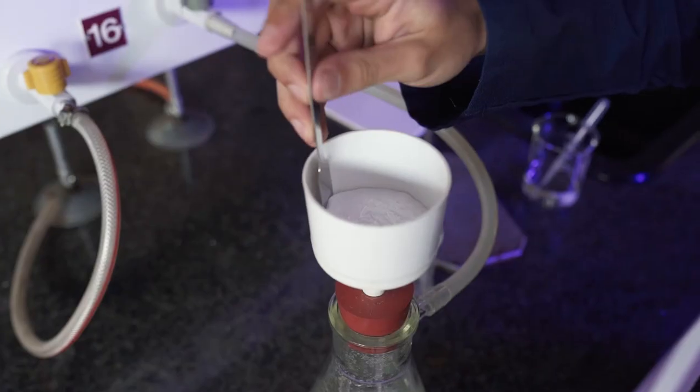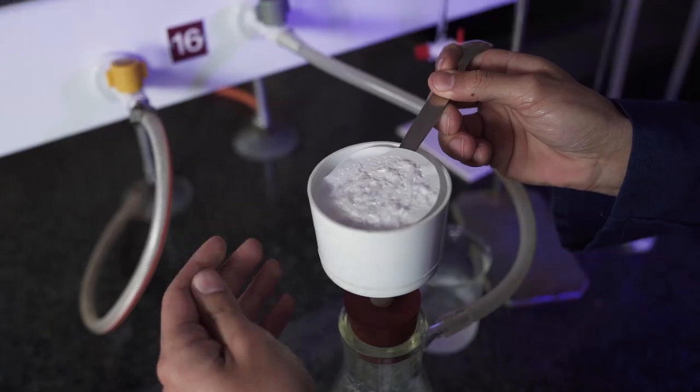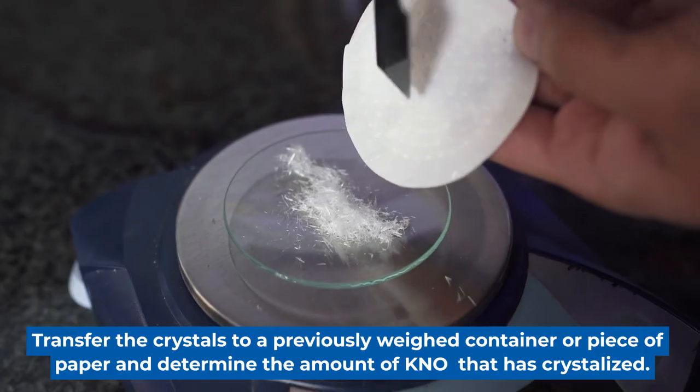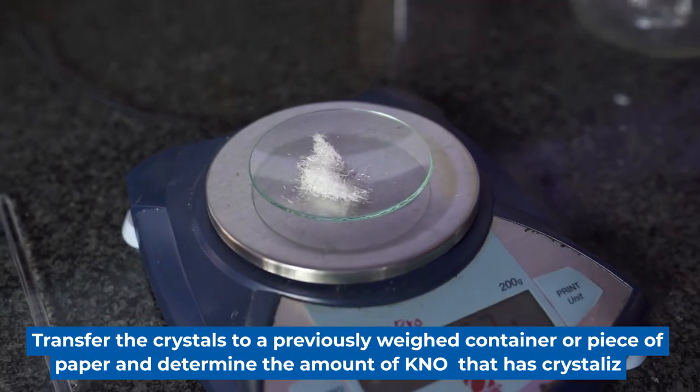Now that the filtration is done, we can remove the filter paper from the Buchner funnel and transfer the crystals to the watch glass so that we can weigh the recrystallized mass.